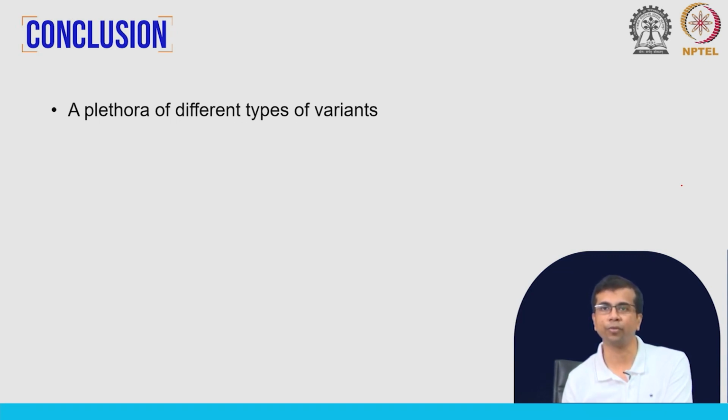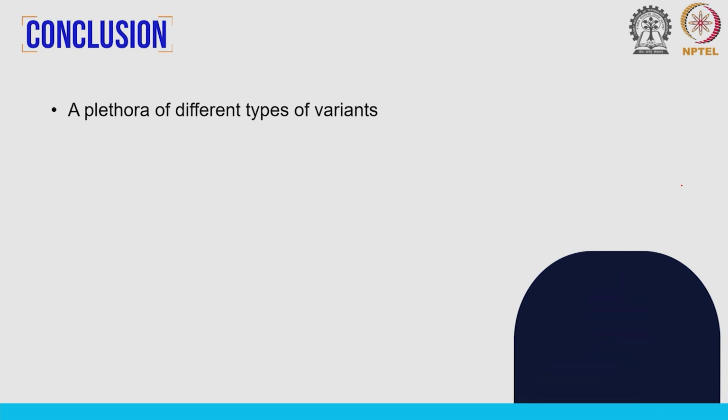So, we will come to the structural variant analysis, and then we will discuss that in much more detail. Very briefly we talked about copy number variations or CNVs, but apart from that we also have non CNV SVs, structural variants, and we also have complex structural variants, which are a combination of CNVs as well as non CNV SVs.